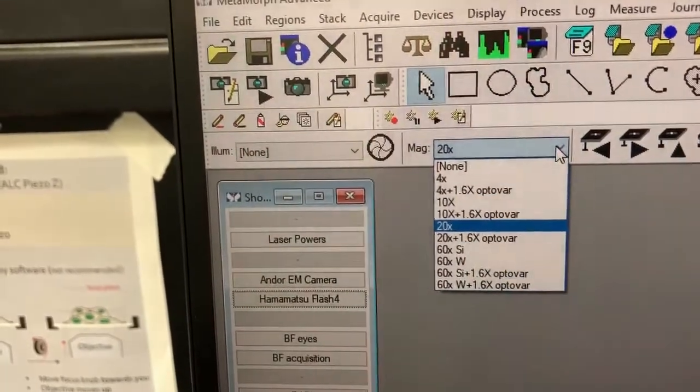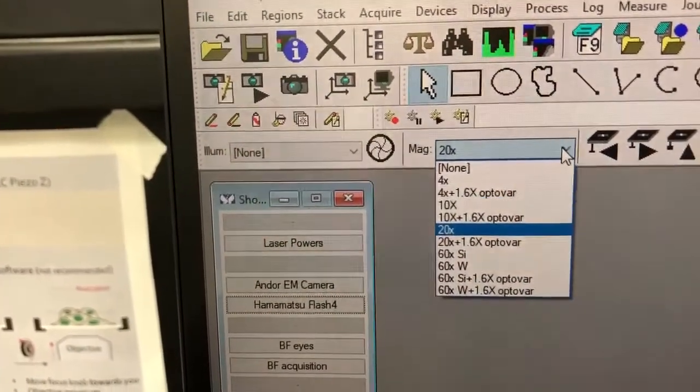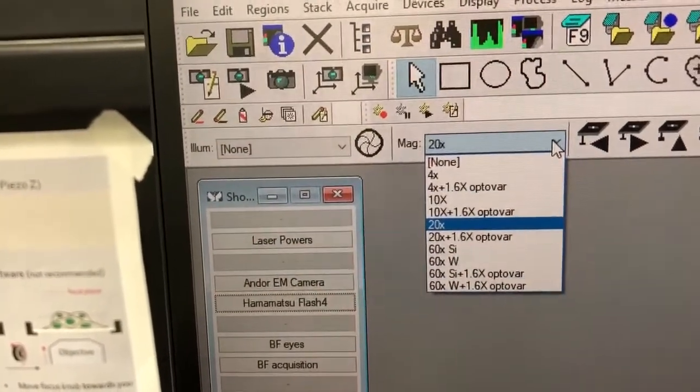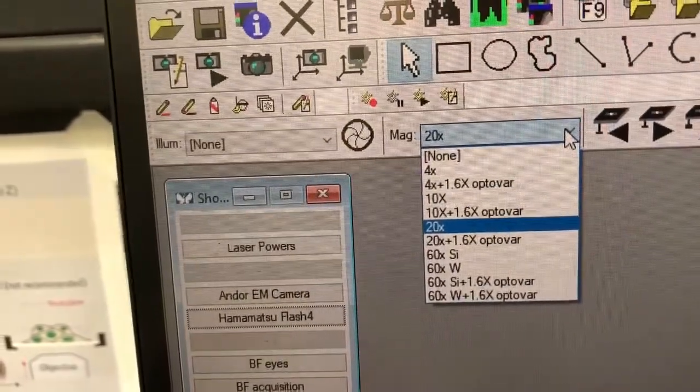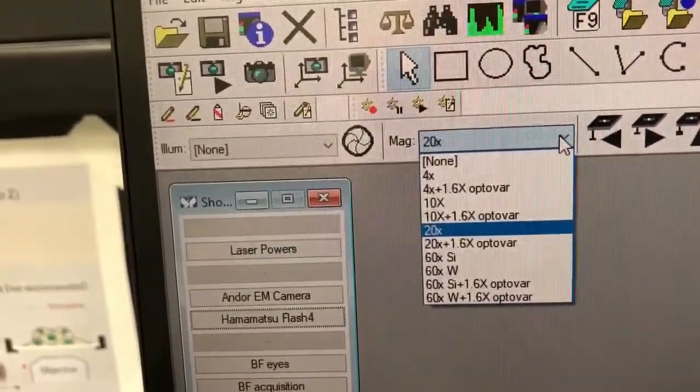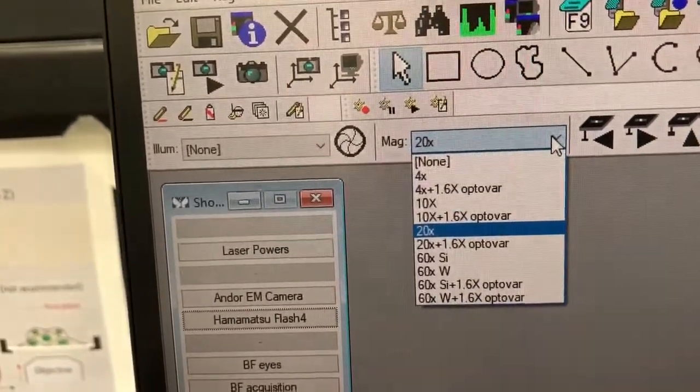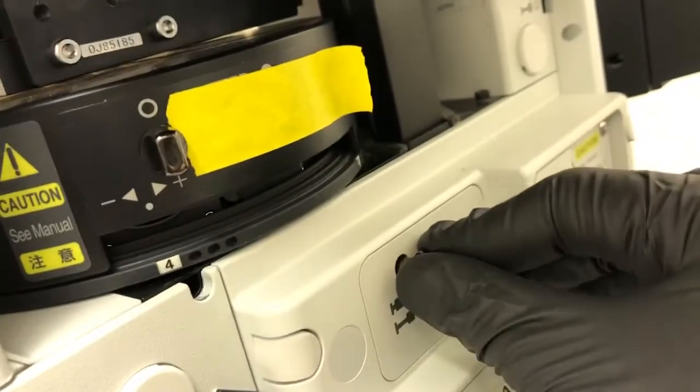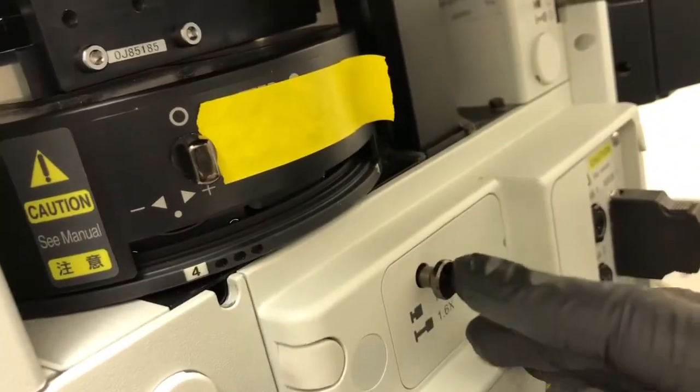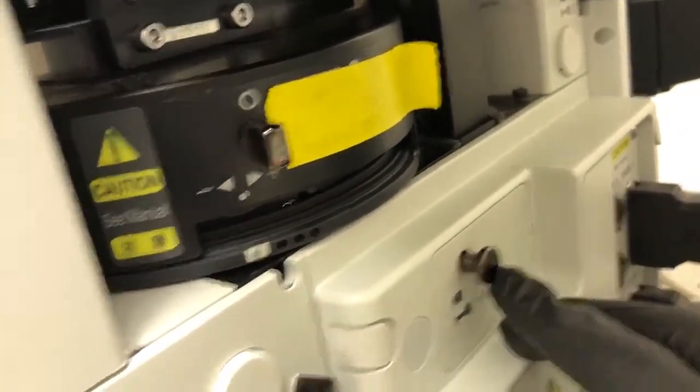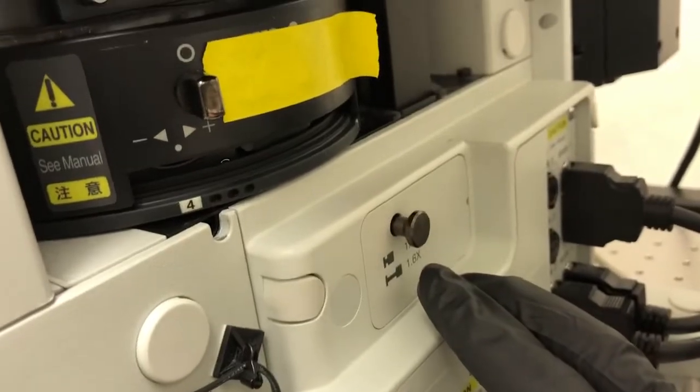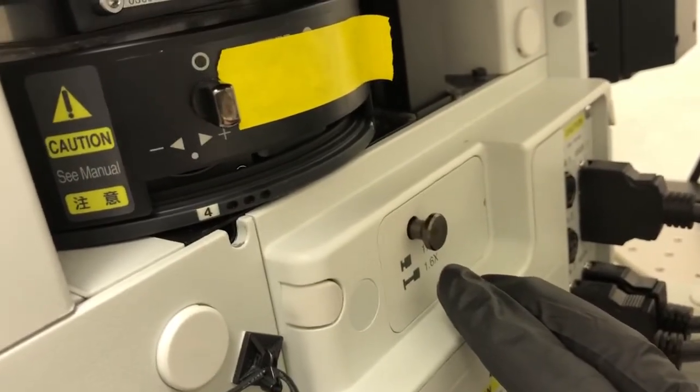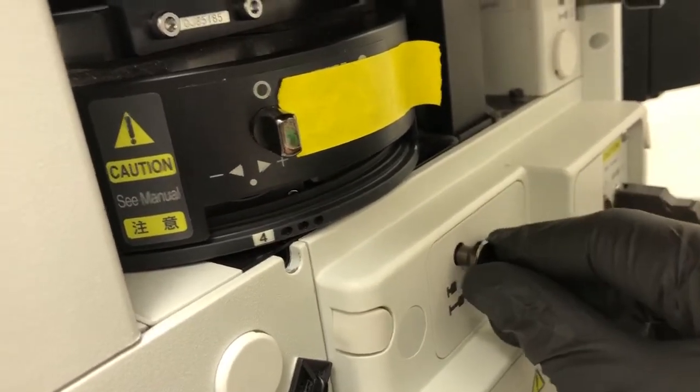Note that there are objectives that have optovars associated with them. Those settings are there in case you pull out the optovar, which is this component here, for increased magnification. So if you need increased magnification, you can obtain that by pulling this out.